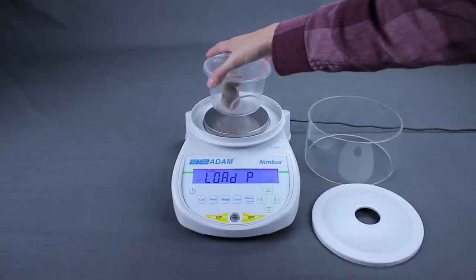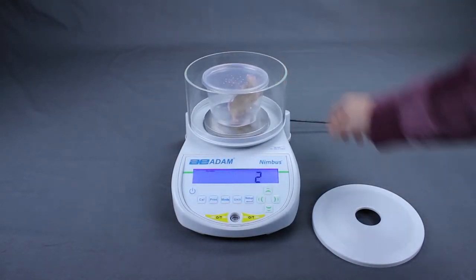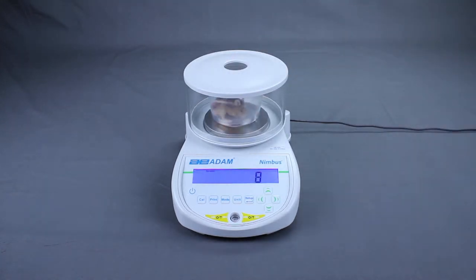If the Nimbus is set for auto mode, load will be displayed. Place the subject in the container and the weighing process will begin immediately. After a preset weighing time, the weight is displayed and will remain until the balance is reset.